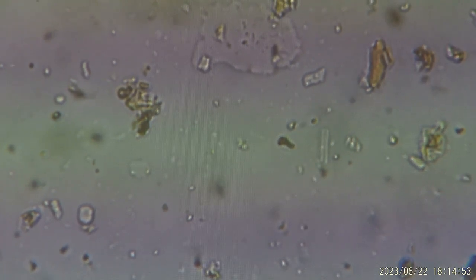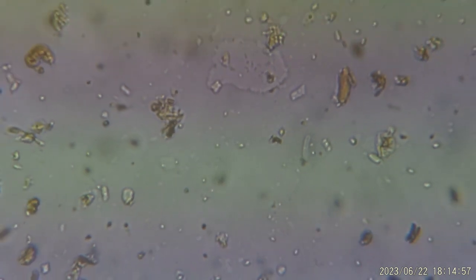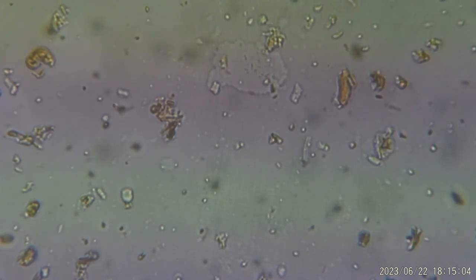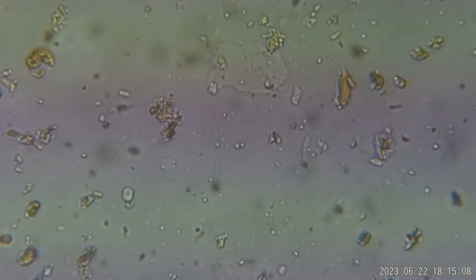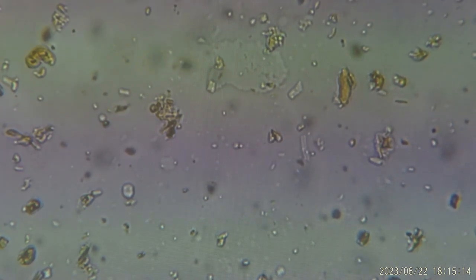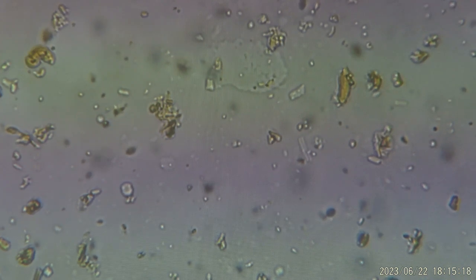This one is really happy being in its environment. Whenever you see a naked amoeba, it's a great indicator that the soil conditions are optimal for its growth. It's not forming a test. It's not forming a shell to protect itself. So it probably has proper moisture, probably enough food sources, and other environmental conditions are just ripe for it.